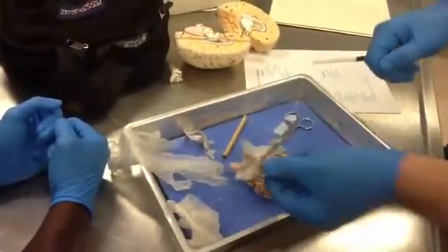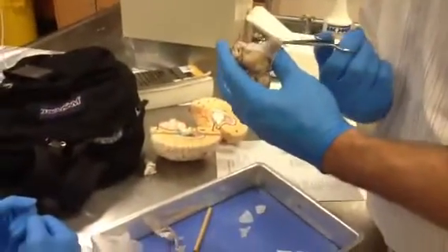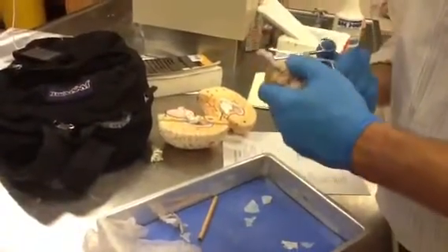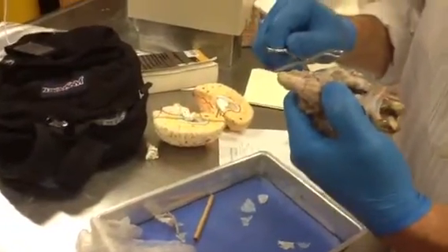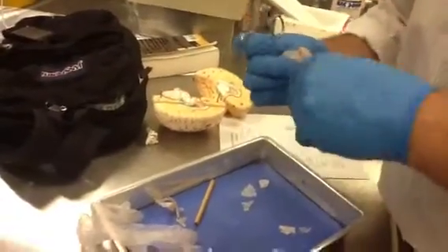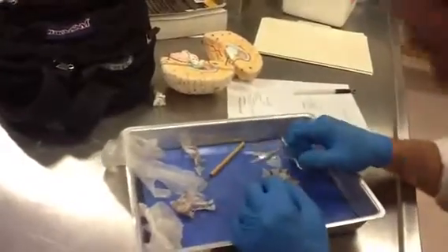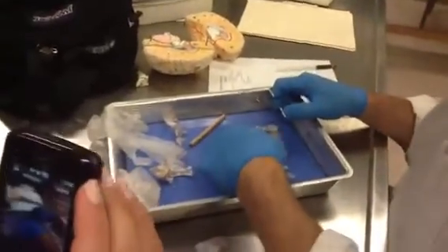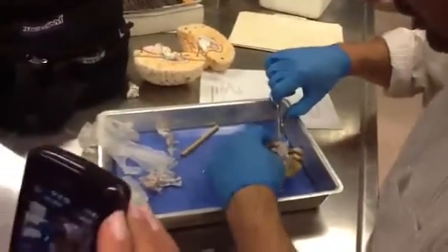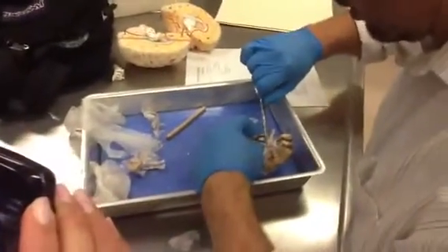All right. So, what we could do now is just get rid of the rest of the dura from the brain stem. And this can kind of just slide off. If I was being real delicate, you could see all these little things are cranial nerves, but we're not looking at all of them, so we're just going to peel that off. And over here, the problem is, without being careful, we're going to rip off the pituitary gland, but I'll try to keep the optic chiasm here if I can. Let's try to get under there. Oops. It's one thing you don't even want to hear a surgeon say.